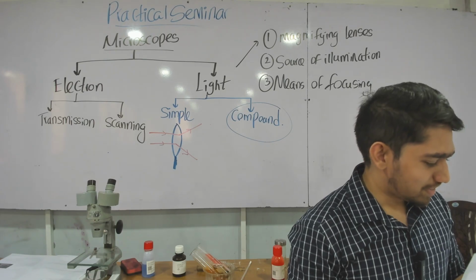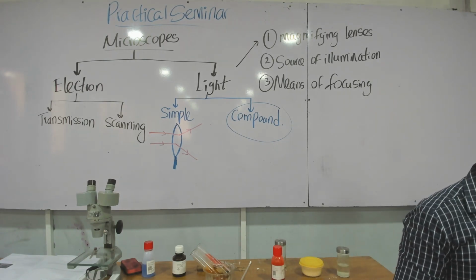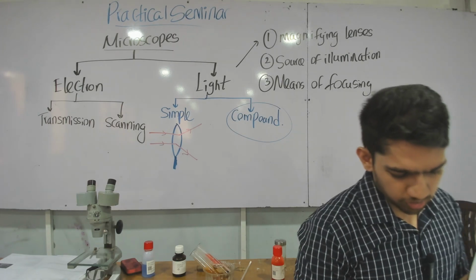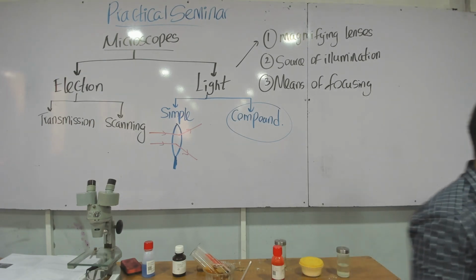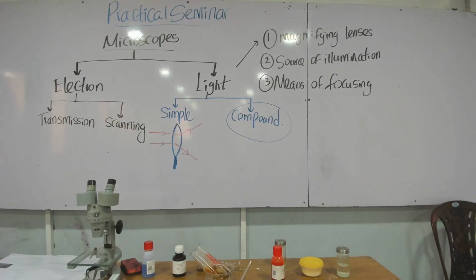Then the yellow color part is usually where you have normal light microscopy, from about 10 micrometers to about 100 micrometers, down to 1 micrometer. Then you can see most of the plant cells, animal cells, nucleus of cells, bacteria, even mitochondria. But if you want to see some viruses, small bacteria and very small subcellular components such as ribosomes, cellular proteins, lipids, up to that level you can observe sort of big protein molecules using electron microscopes.